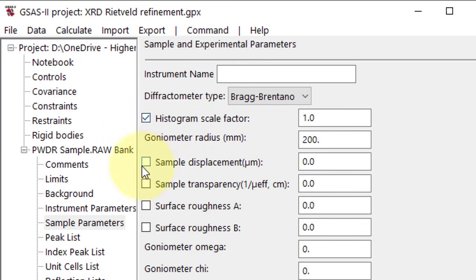This step is vital because we will be optimizing the structure with two known phases, each with different intensities. Therefore, it is necessary to untick this option as we do not want to scale the intensities equally. After that, the rest of the parameters will remain unchanged.